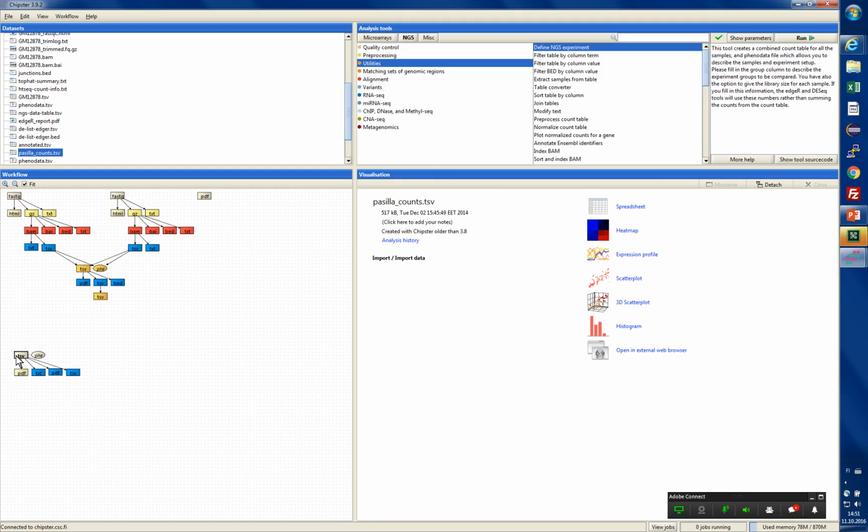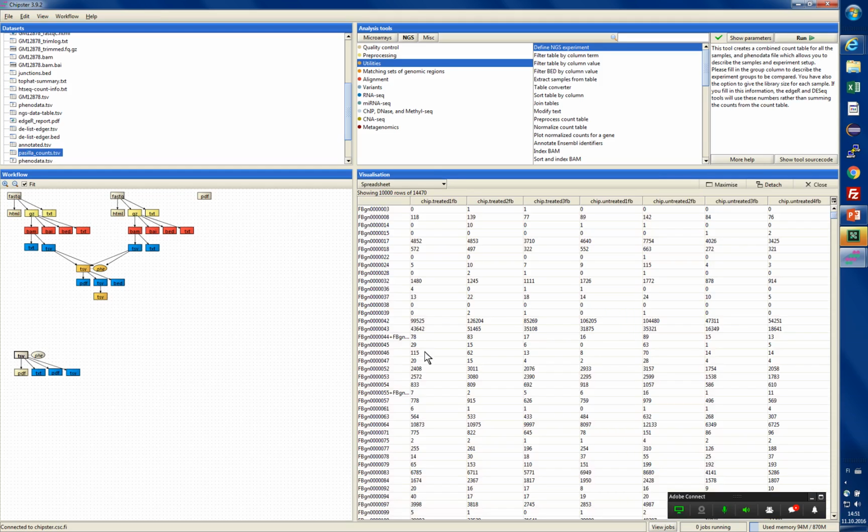And if you look at the actual count file, here you can again see the different samples. So here we have the gene names. These are FlyBase identifiers for Drosophila. And then how many counts does this gene have in the different samples that we do. So you can see that the count levels vary quite a lot between the genes. So now Maria will continue from that, discussing the PCA plot.